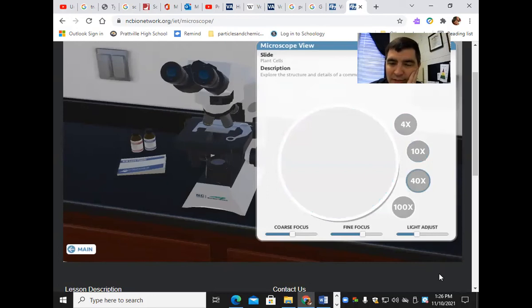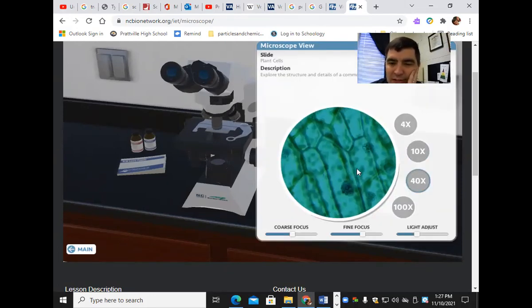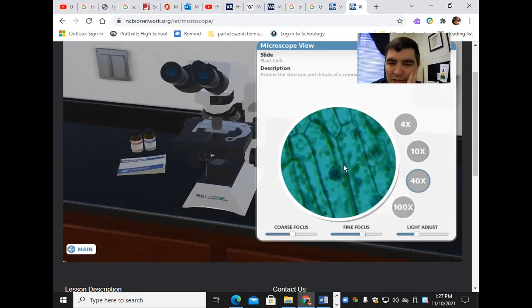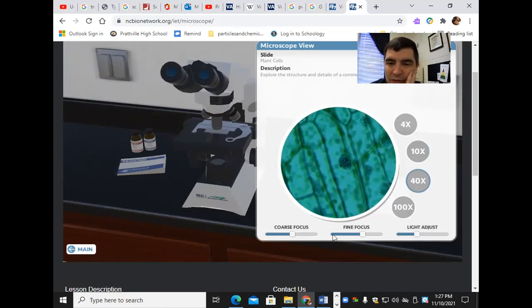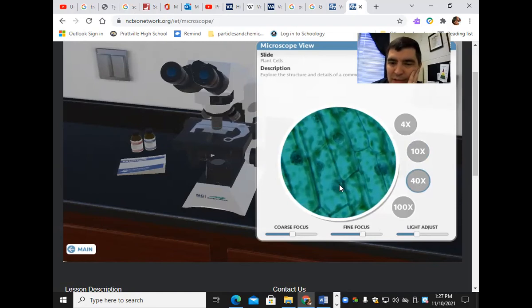And so now I have 40x. I can really start seeing the chloroplasts here — now you can really start seeing those chloroplasts. You can see those chloroplasts in there and there's the nucleus. That's one cell right there. Those are the nucleus and you can see those chloroplasts beautifully.